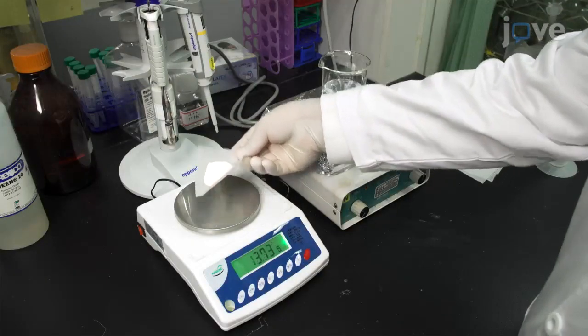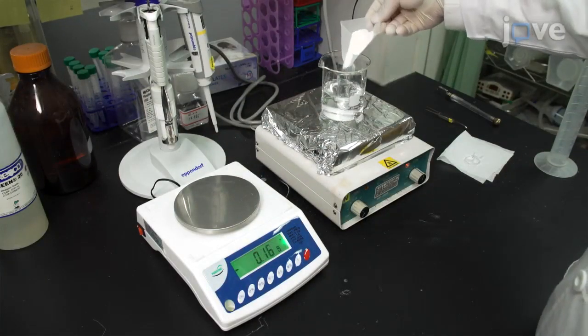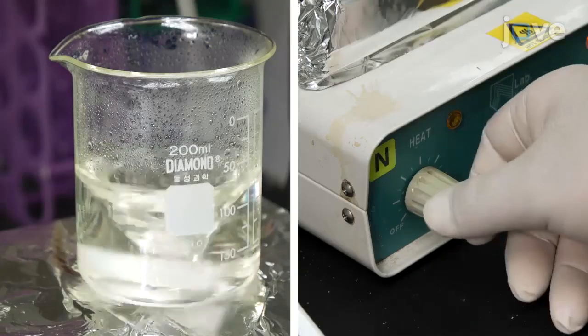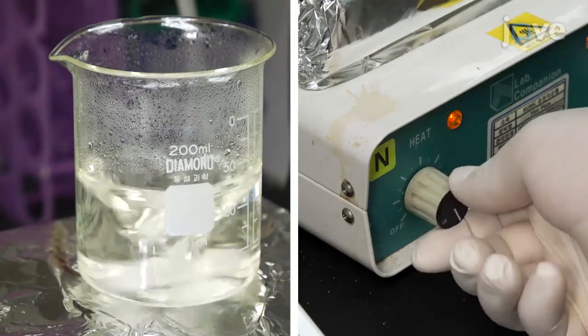Next, dissolve 3 grams of agarose in 100 milliliters of 3 molar potassium chloride and place it on a hot plate between 90 and 100 degrees Celsius.